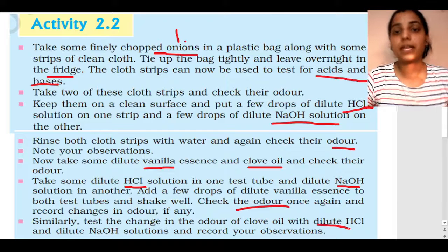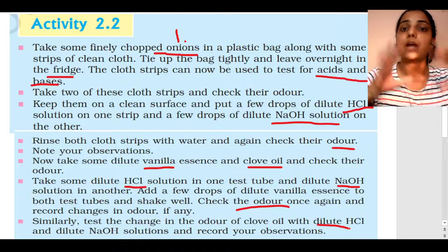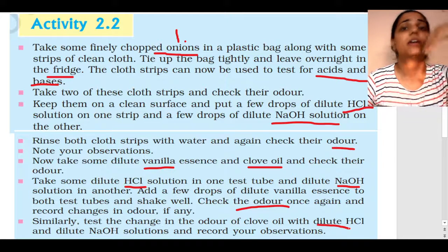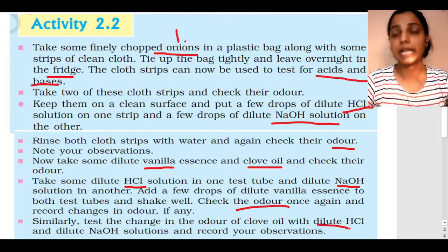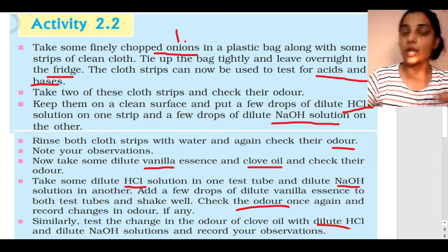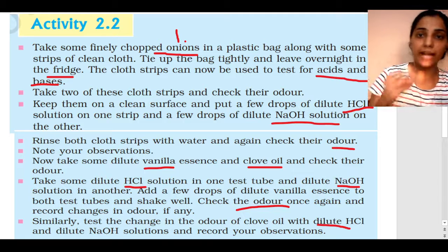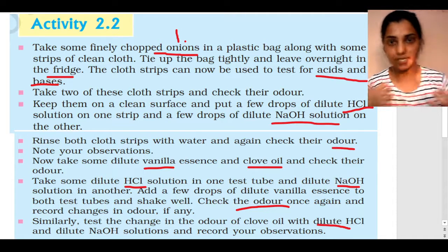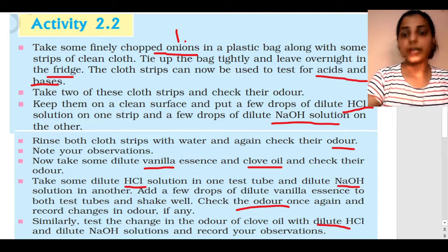पहले हमें पहली वाली जो स्मेल है, हमने जो बिना कोई HCl NaOH के जो हमारा प्रोडक्ट है, पहले हम उसकी स्मेल ले रहे हैं फर्स्ट, आफ्टर मिक्सिंग विद एनी सोल्यूशन. We just want to identify कि अगर हम कुछ ऐड करते हैं as in solution, so उसमें क्या changes आते हैं, isn't it? So this is basically what this activity is all about, right?